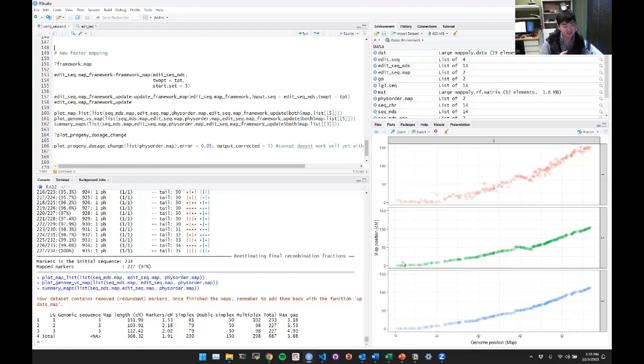It can take days to weeks or months for the chain to actually finish, because as you add more markers in MAPpoly, when it's running the hidden Markov chain, it has to check its work backwards as it adds markers. So as you add more markers and get into the 500-600 range, it takes longer and longer to add another marker.